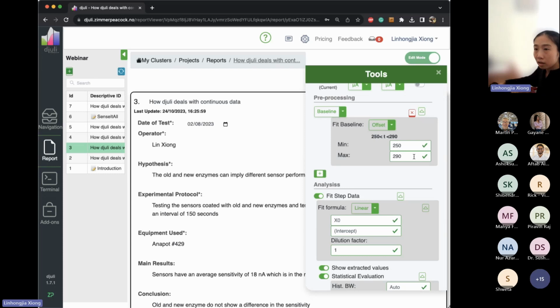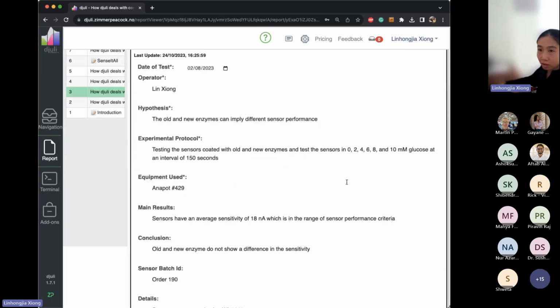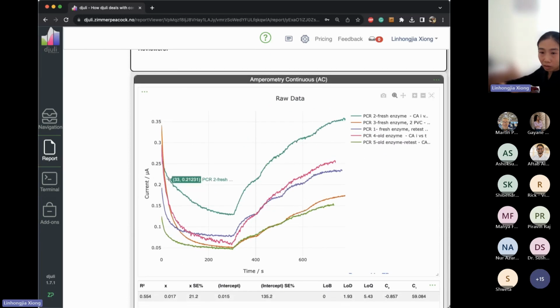With some data, when they come in, you will notice that not all the sensors are in the ideal case of having a perfect baseline, which would give an easy comparison from one data set to another. So what we need to do is set a baseline. Let me give everyone a quick look at how the data looks. This is the raw data. As I mentioned, you can see the baselines are not all drawn down to 0, and they are not even together.